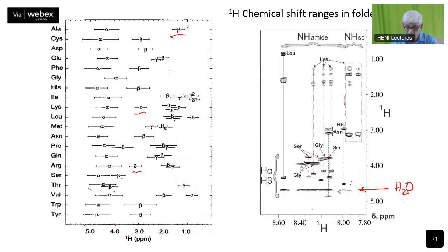The histidine shows alpha proton, then the beta proton here, and that's it. So there is no alanine here. This spectrum doesn't have alanine. So the typical certain residues are there in this, and all of them can be identified. And the sequence of peaks which are present, all these are lysines. These are beta 1, beta 2, gamma 1, delta 2. So that's the way these lysines are going. All the three are lysines there. And why is this one here showing lysine? This is because it is showing a side chain epsilon. It's going to the epsilon there.